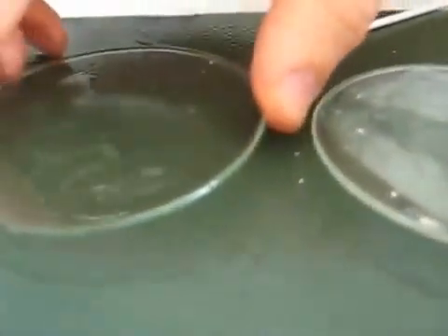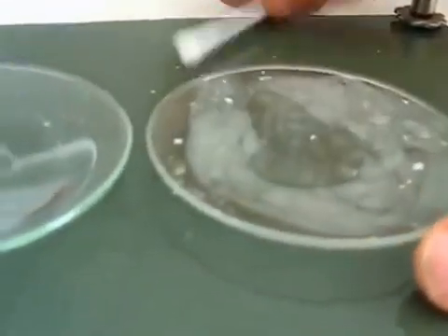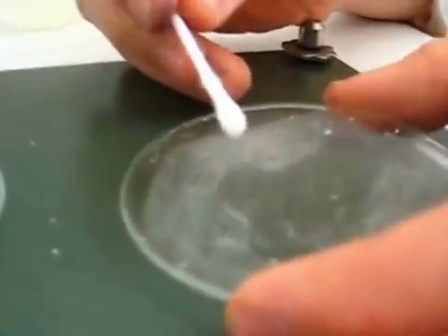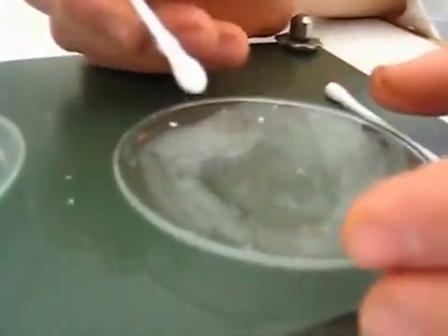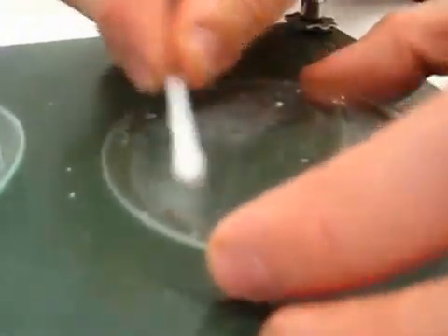And likewise here, it behaves differently. But there is a slight difference between here and here, as you can tell. There is a slight ridge here on the edge of the liquid.